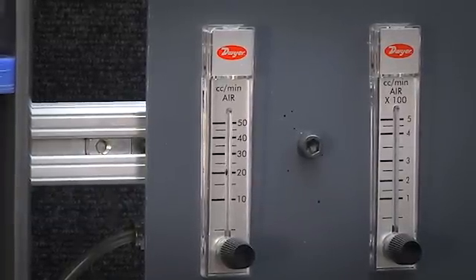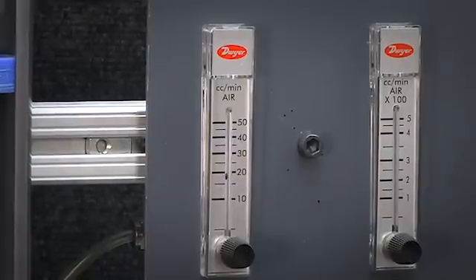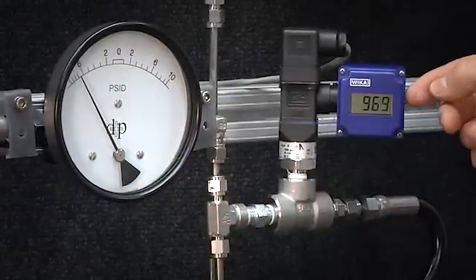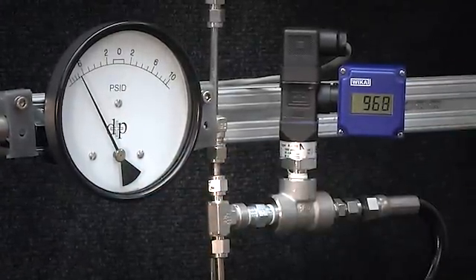So we are now at the range of about 20 cc's per minute and we are still at 7 psi over pressure and still at 969, about the same pressure that we had before.